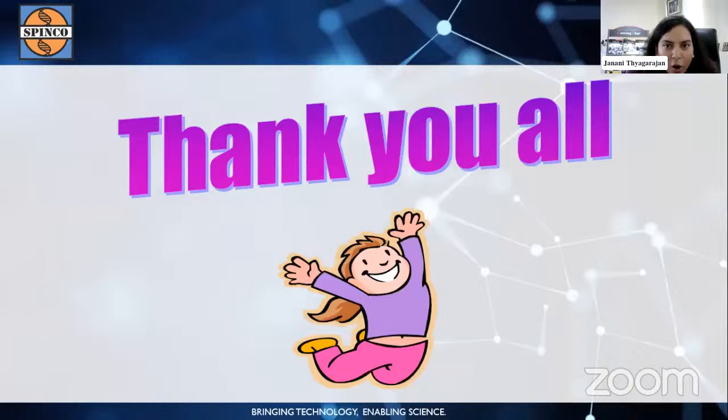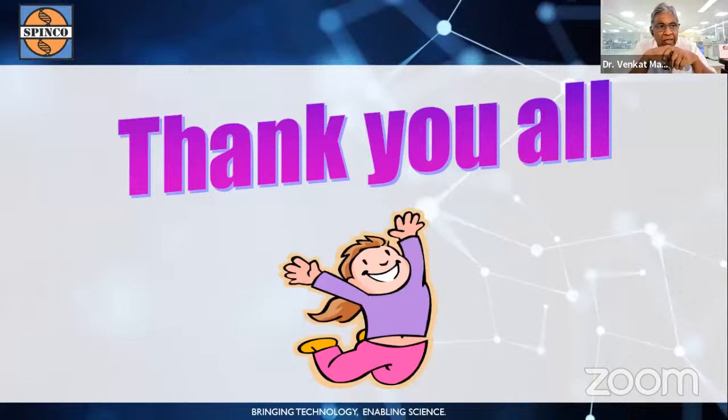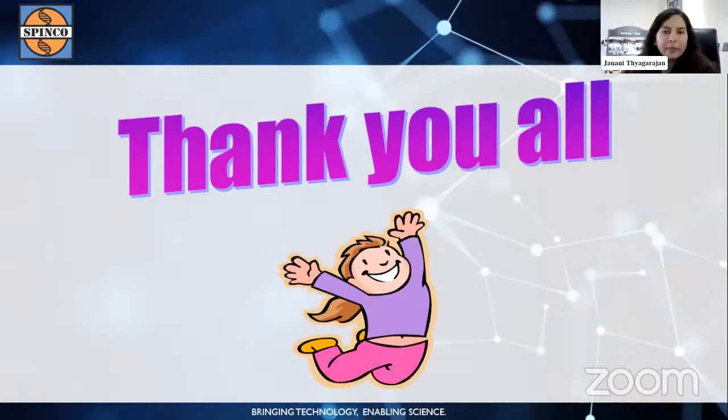What is SIMS, secondary ion mass spectrometry? That is what is called SIMS, a surface enhanced ionization technique. In my presentation, I have not covered that. It is mainly used for various other applications, such as fatty acid analysis in many biological applications, which I have not covered here.